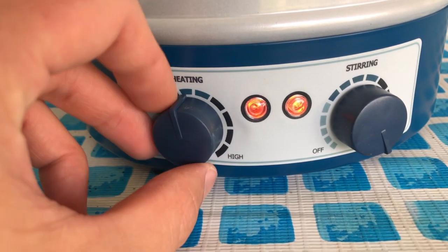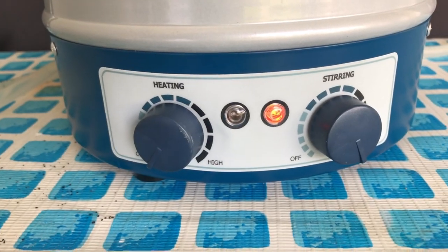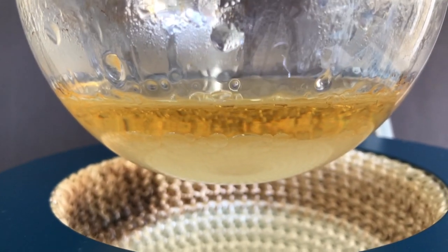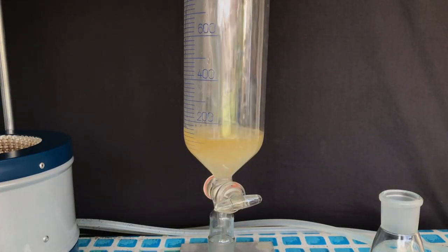One hour has now passed and the heating mantle was turned off. Two layers became visible and everything was transferred to a separatory funnel. The bottom layer is the aqueous layer and it was drained off.